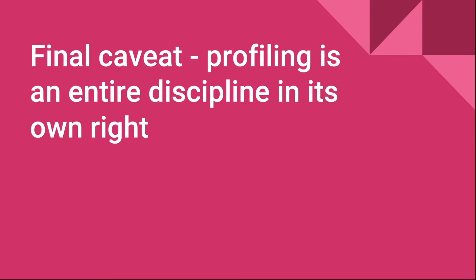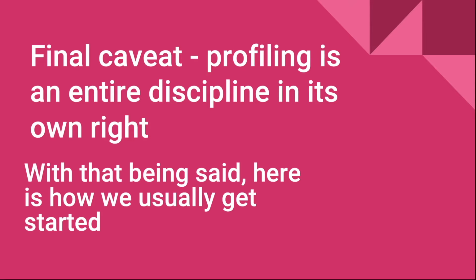And the final caveat is just that morphological profiling is a huge, rich field that is constantly evolving and has methods all of its own. So I'm only going to show you today a tiny slice of what is possible with these sorts of techniques, but this is the tiny slice that in practice we typically get started with.